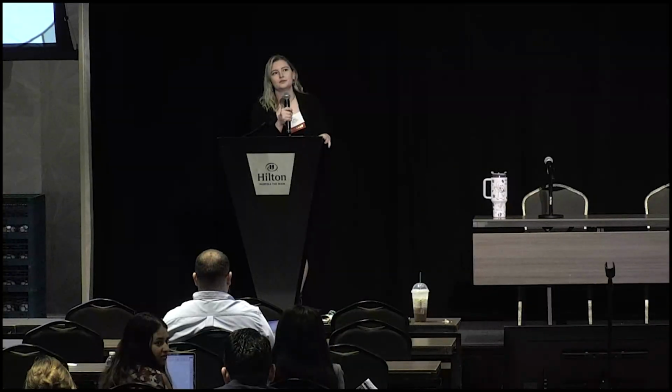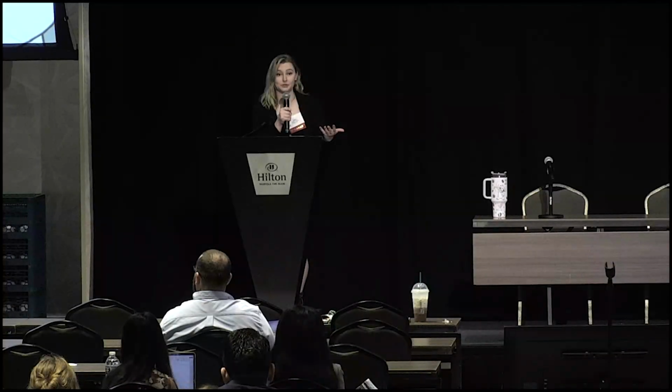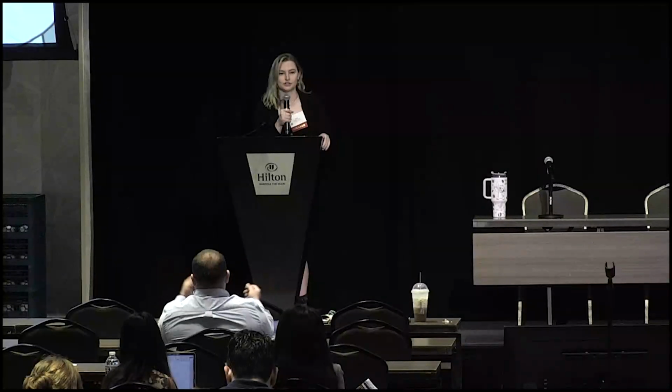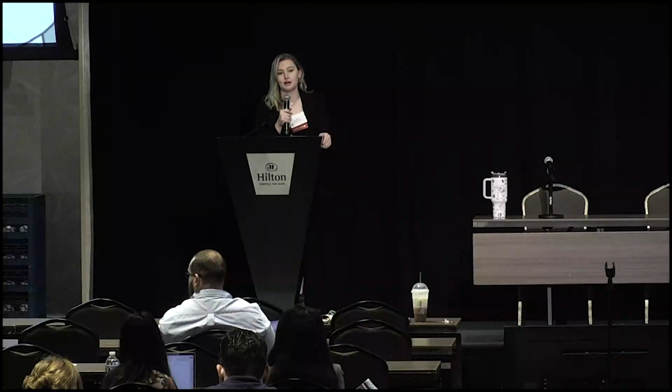But to address your first question, I'm sorry, I actually got really caught up with the crochet. Can you repeat the question? Yes, I'm just curious how the large size of the inserts would impact it. So there is actually a formula I use for how much of each insert I will use in a Golden Gate reaction. I didn't put that on my blog, but that's a good thing that I should. Many publications will actually say how many nanograms they recommend per size of construct. So check with each publication, but I can certainly put the one that I use on the website.